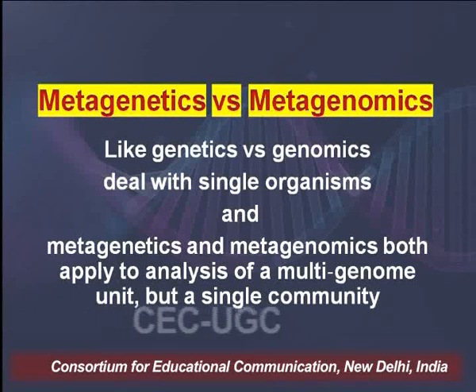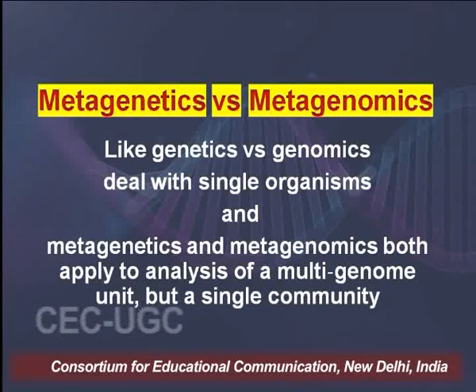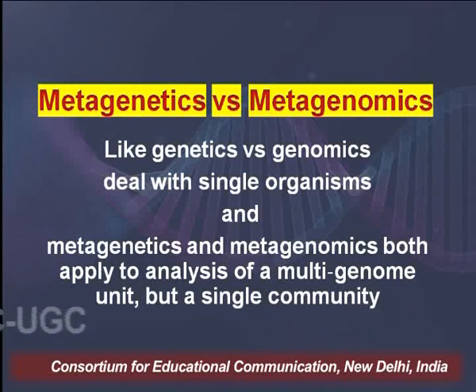and in there we will limit ourselves to 16S rRNA sequences, not the whole genome sequences which we talked about earlier. I would still suggest you go back to our part 1 and part 2 lectures on metagenomics. Still, I have revised most of the concepts so that today's study is not hampered.